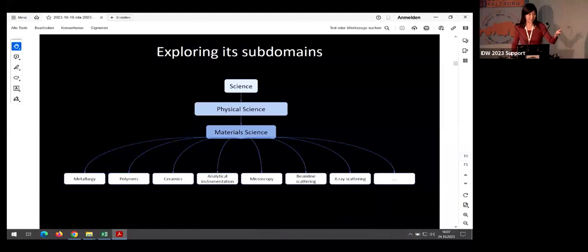So my BAM colleagues over there have developed an ontology for material science and engineering, and it's called the PMDCO, and they have published extensively on this. As they explained it to me, it's a mid-level ontology that describes a lot of the concepts in material science and how they're related. If you think about material science, you could group things by the material classes, say metallurgy, polymer, ceramic, and so forth. You could talk about the techniques that you use to look at that material. So for example, analytical instruments, beamline, X-ray, but the NIST work is focused on electron microscopy.